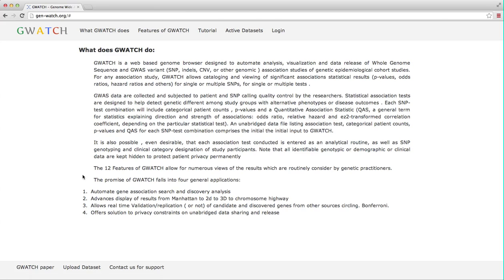First, GWATCH automates gene association search and discovery analysis. Second, GWATCH offers automatic display of results from Manhattan plots to two-dimensional and three-dimensional snapshots, vital to a dynamic chromosome highway browser.